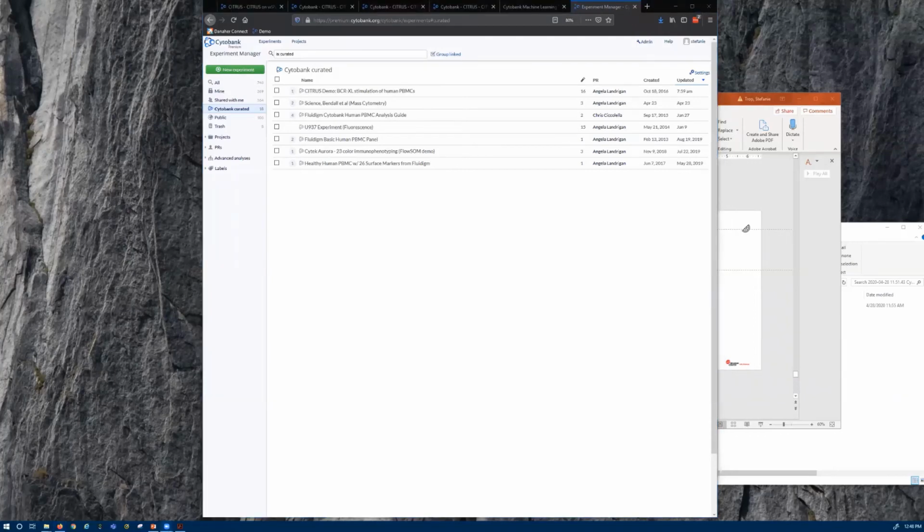And I guess in short, yes, you can do that. But Citrus has two other algorithms which we think in certain cases are much better than the regular SAM method or the FlowSOM plus non-parametric testing method. But I can see the FlowSOM plus non-parametric testing approach is very flexible, and you can easily construct whatever test you want to do. If you're familiar with doing non-parametric tests, then yes, you can do it for that. Okay, thank you so much.